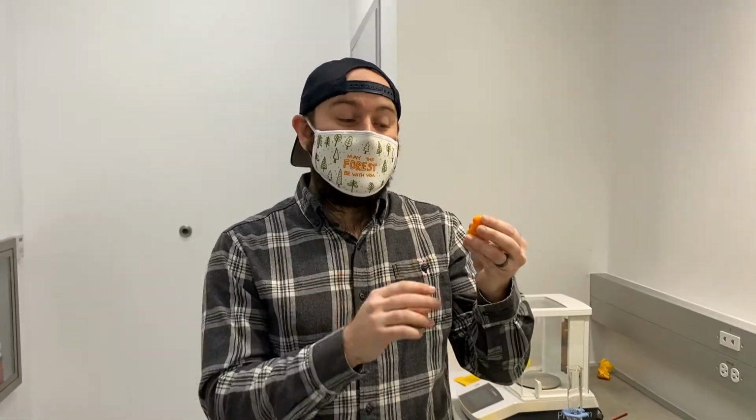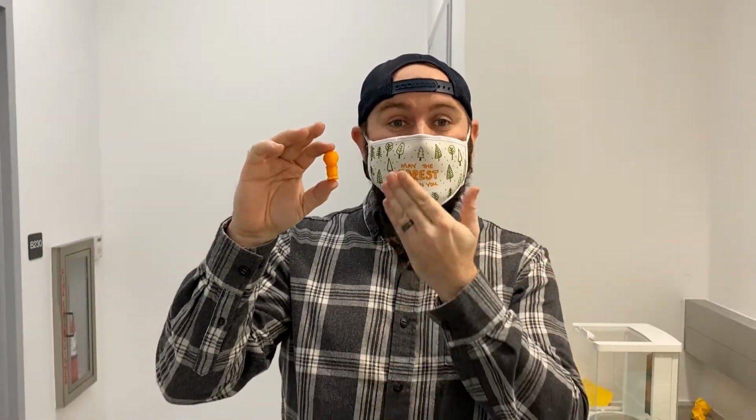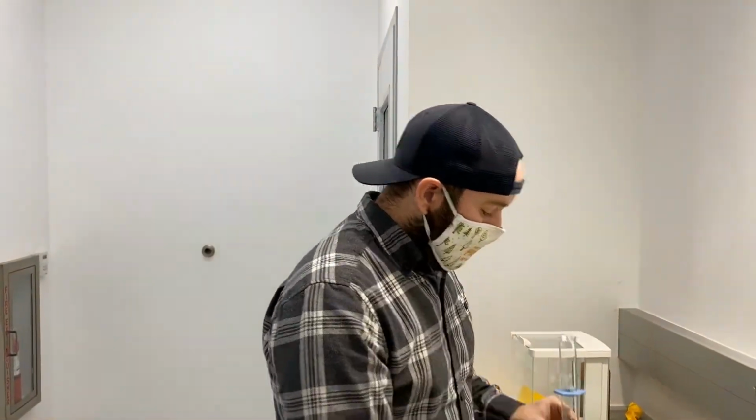All right, so in part 2 or part 3 of this experiment where we're measuring the density of a solid, we're going to use an irregularly shaped solid, so we need to measure volume by displacement. Now the first thing to do is measure the mass of my little alien unknown solid here. And we get the mass of this alien, just using the mass balance like we saw in earlier videos, is 4.898 grams.